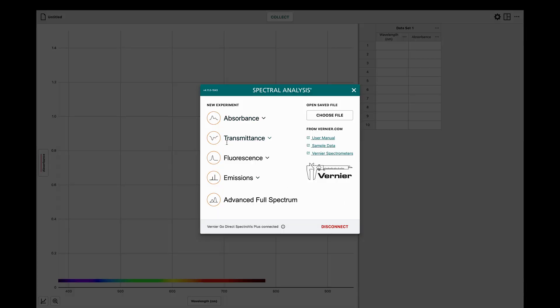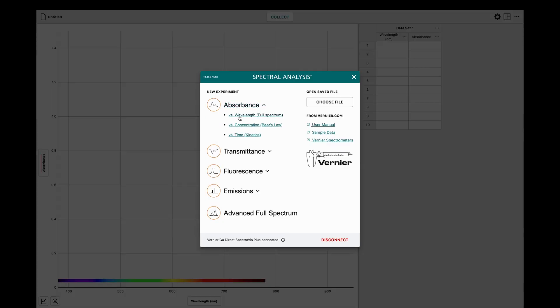Now you're ready to select your experiment. Select a spectrometer mode from the list of options. With GoDirect SpectraViz Plus, your options are absorbance, percent transmittance, fluorescence, emissions, and advanced full spectrum. Once you've selected the type of spectrometer mode, you need to select the type of experiment from the drop-down menu. Today, I want to do absorbance versus wavelength, but I could also do Beer's Law or a kinetics experiment by clicking on the appropriate option.